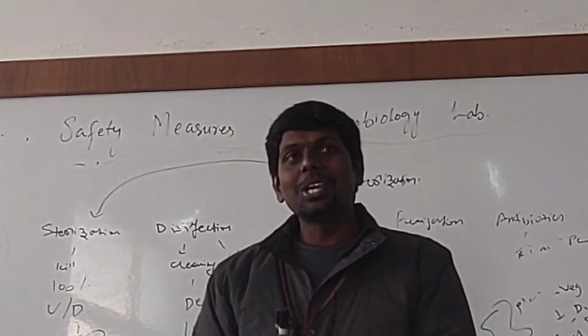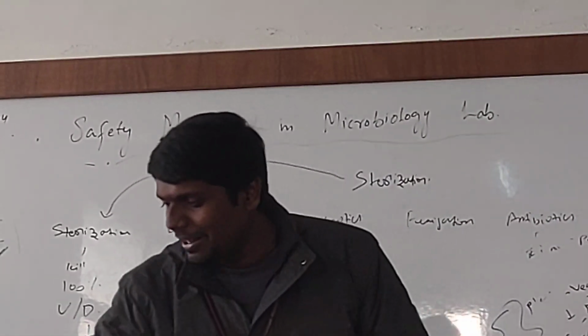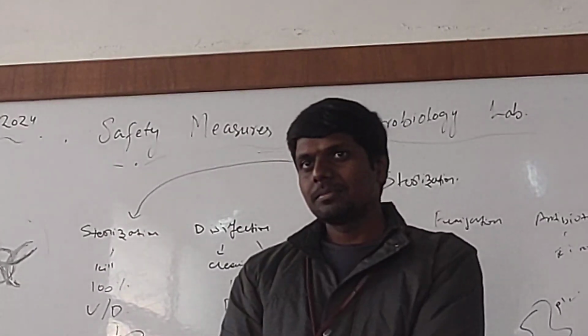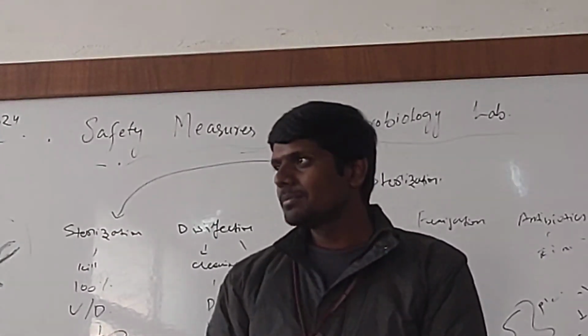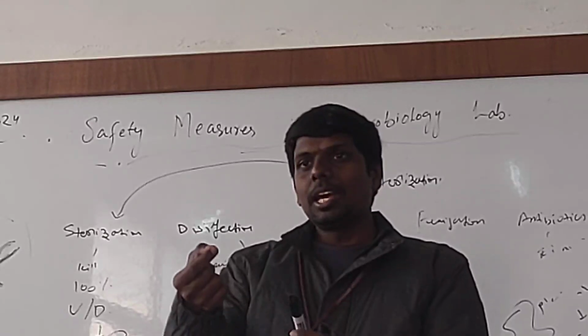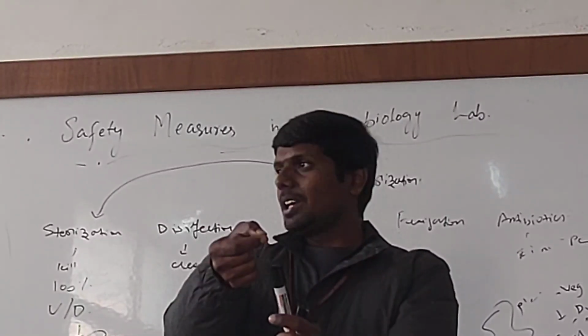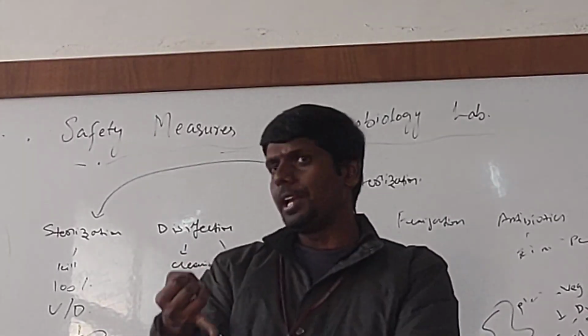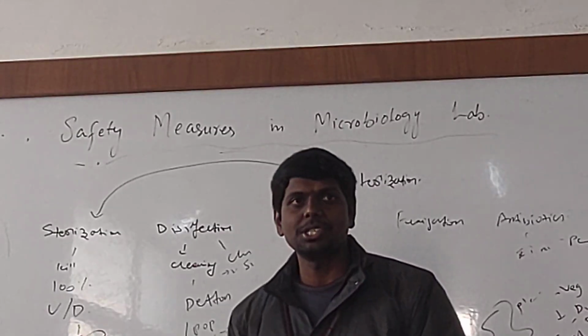Why are you confused? Why are you afraid? Listen, there is a candle and there is an open fire. Can I keep a microbe on an open fire? That will be dry heat. With a loop, we will heat the loop. That is a dry heat sterilization. So open flame is there. Any other such dry heat sterilizations?